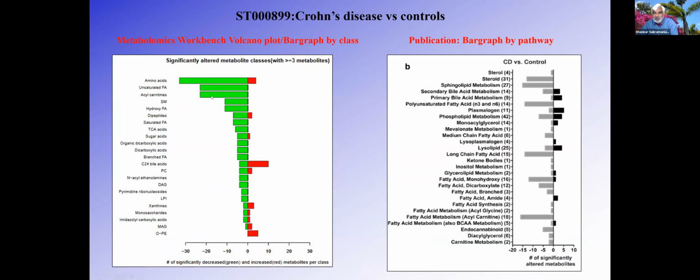Again, we provide you with tools to look at it in terms of altered metabolites, negatively and positively. You can look at them, CD versus control, etc. So please go home and look at it.